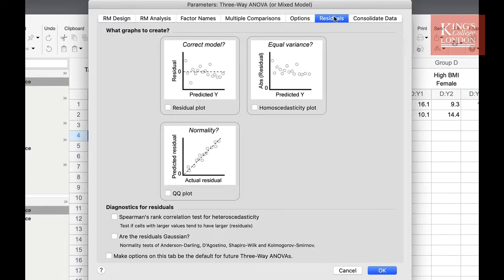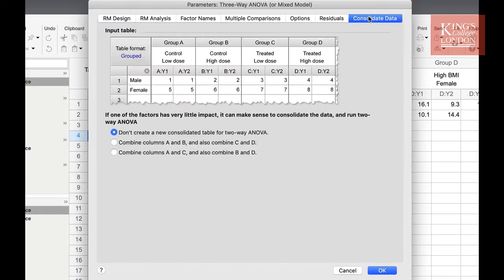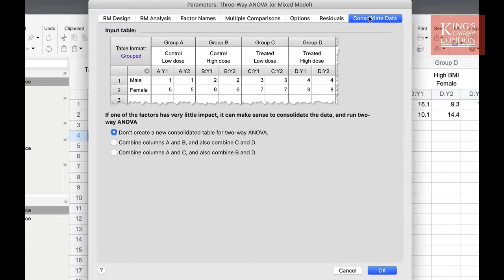In the consolidate data tab, you can choose whether you combine A and B and C and D, or combine A and C and B and D for further sub-analysis. For instance, after I have carried out this analysis, I might want to look simply at the control versus treated.